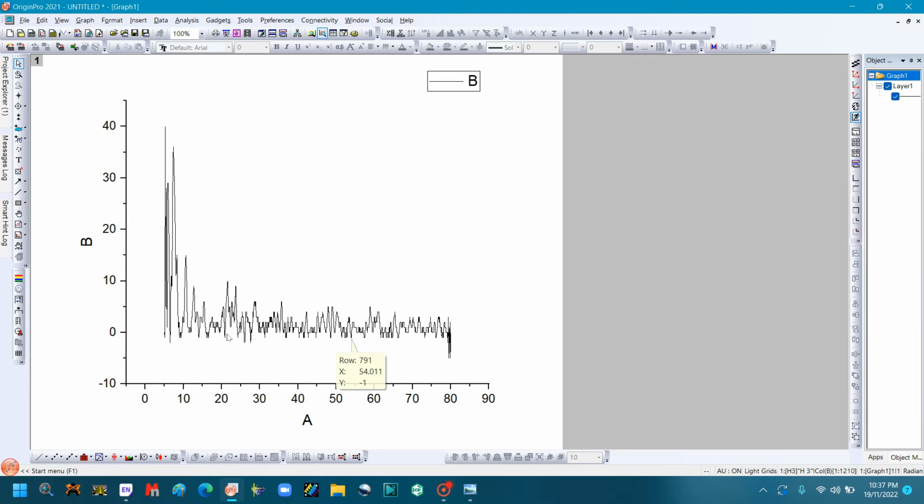So you can see here there is so much noise in the graph. It means that there is impurity in the graph, especially when we think from the research point of view. So we want to smooth it, because in this graph we cannot find out the exact crystallinity or the grain size or the percentage crystalline report of the XRD graph. So we will first smooth it to remove its noise, and then we will set its baseline.